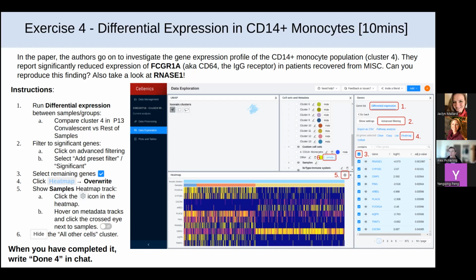You can get those trajectories as Peter described. It's missing some features where, often for trajectory analysis, what you're interested in is what genes are changing along a trajectory. And that's not something that you can do right now. So that's definitely a great thing to be adding to it, definitely things that need to be added.